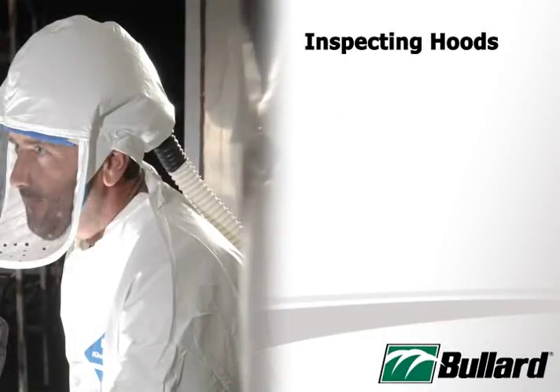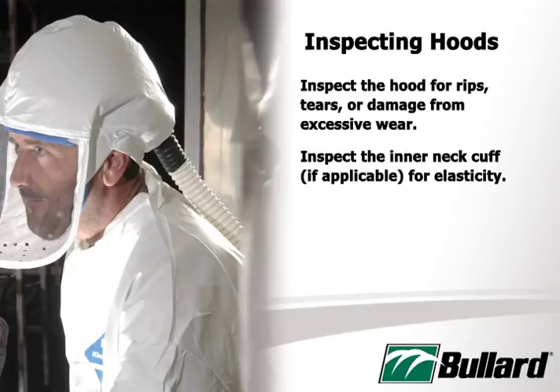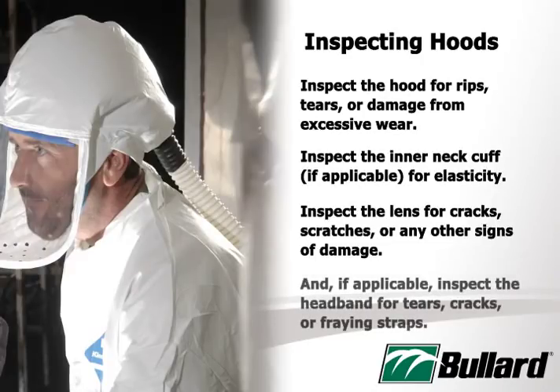Before donning a hood or loose-fitting facepiece, do the following. Inspect the hood for rips, tears, or damage from excessive wear. Inspect the inner neck cuff, if applicable, for elasticity. Inspect the lens for cracks, scratches, or any other signs of damage. And, if applicable, inspect the headband for tears, cracks, or fraying straps.